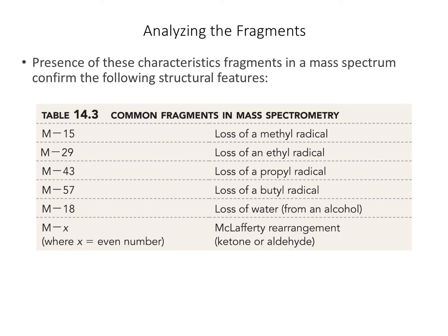And so one thing that we'll provide for you on quizzes and exams where you're analyzing mass spectra is this table. While these aren't that hard to calculate, you don't have to memorize them or anything. We'll give you this table, and so you can look, right, for any big peaks, calculate the difference between that peak and the parent ion peak. If you get a 15, probably a methyl. A 29, probably an ethyl, and etc.